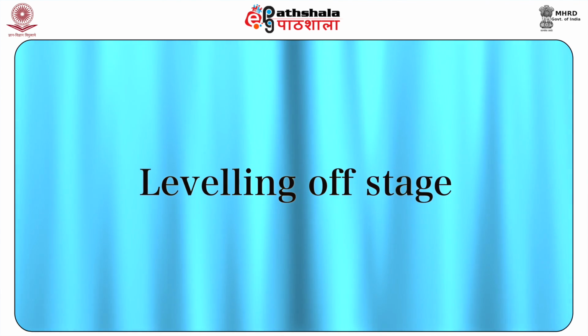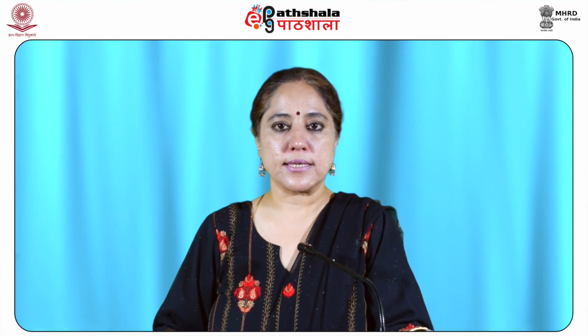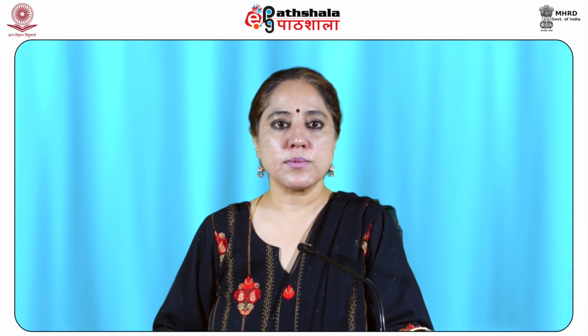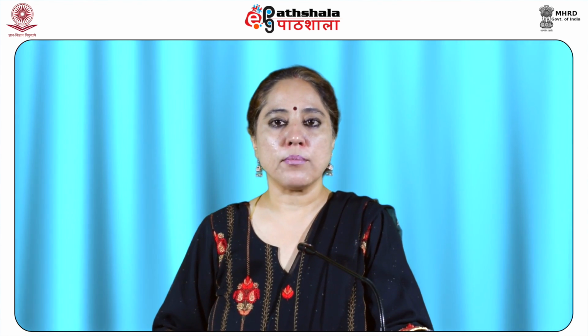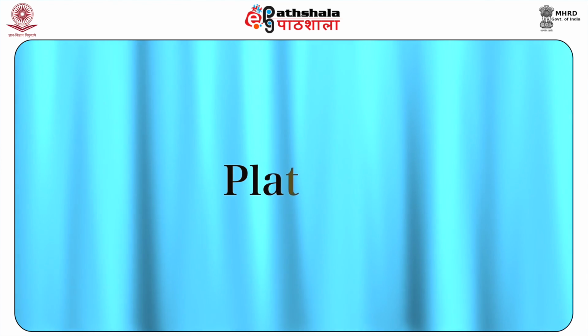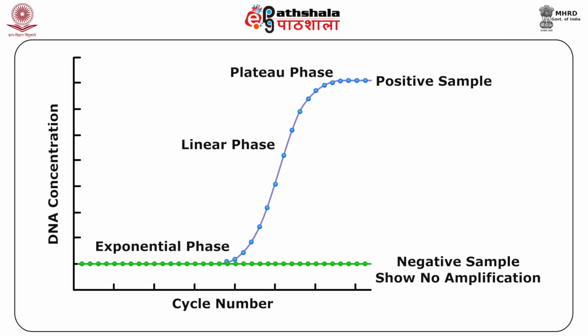The next, the leveling off stage. Over time with repeated cycles, there is some loss in the activity of the enzymes, and the use of reagents like dNTPs and primers makes them restrictive, and thus the reaction pace slows down. The next, the plateau. The reactants are exhausted and no more products are synthesized due to unavailability of the reagents and or the loss of enzymatic activity.